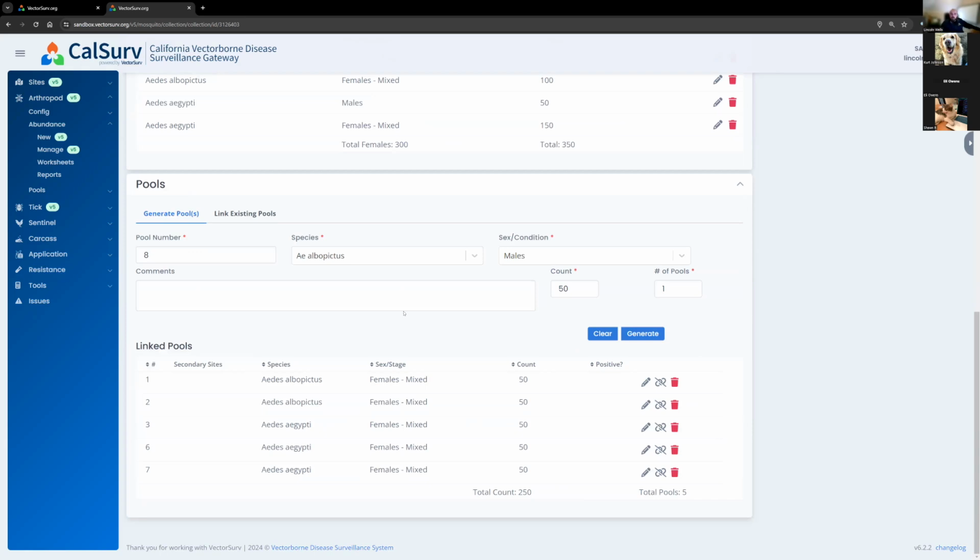Okay. There is a question, Lincoln. Yes, currently you can enter species information here. It'll give you that validation error. And I'm going to talk about why these species are available in that pull down menu in just 1 second here.